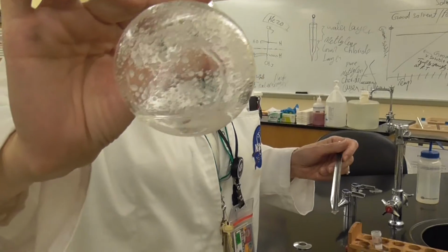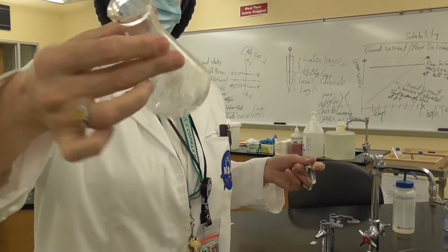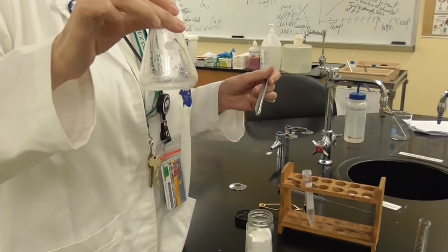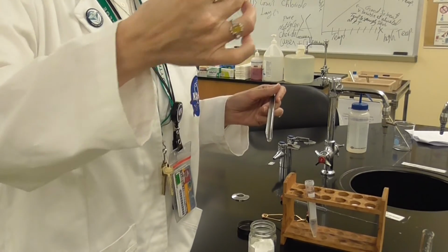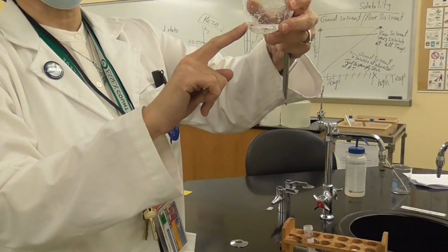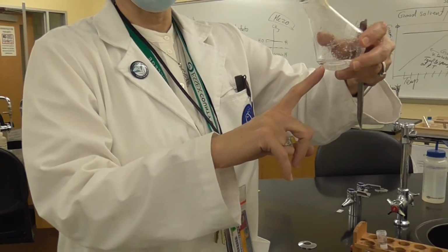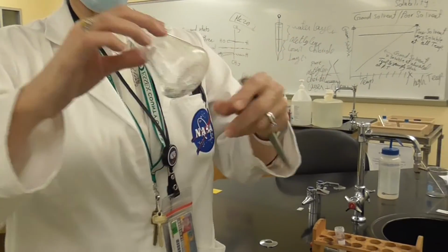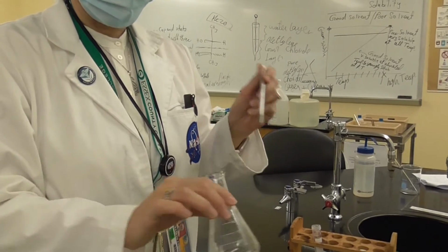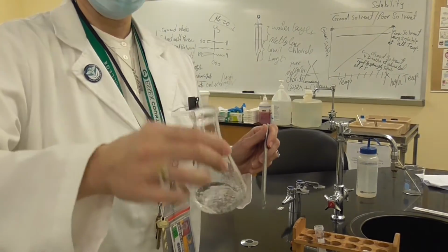You can see how the water is going to cling to the sodium. You see that? So I need more of it until it all gets stuck at the bottom of your flask, and then leave the clear, pure, dry layer of methylene chloride here. So I still have some of the water there, but I'm going to add more. It seems that we do have a lot of it.